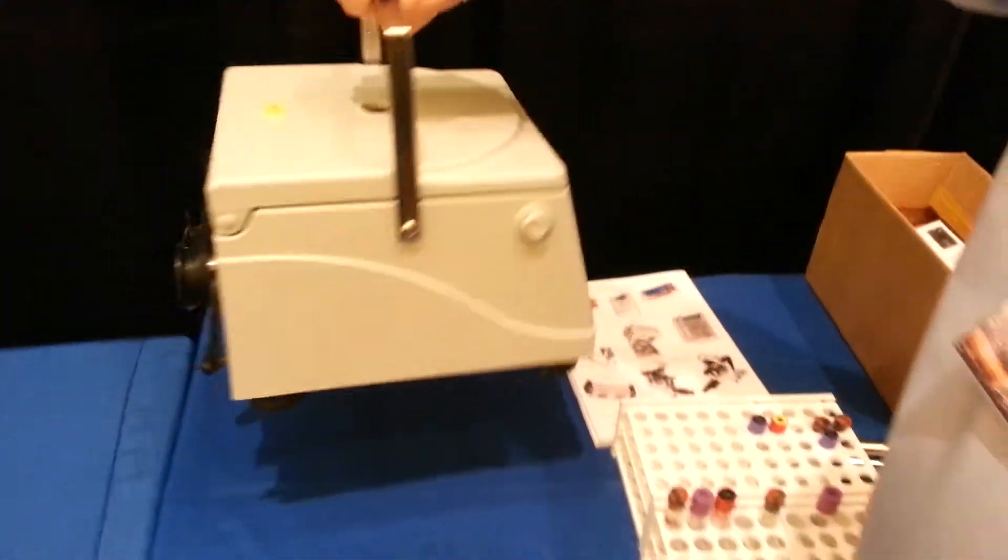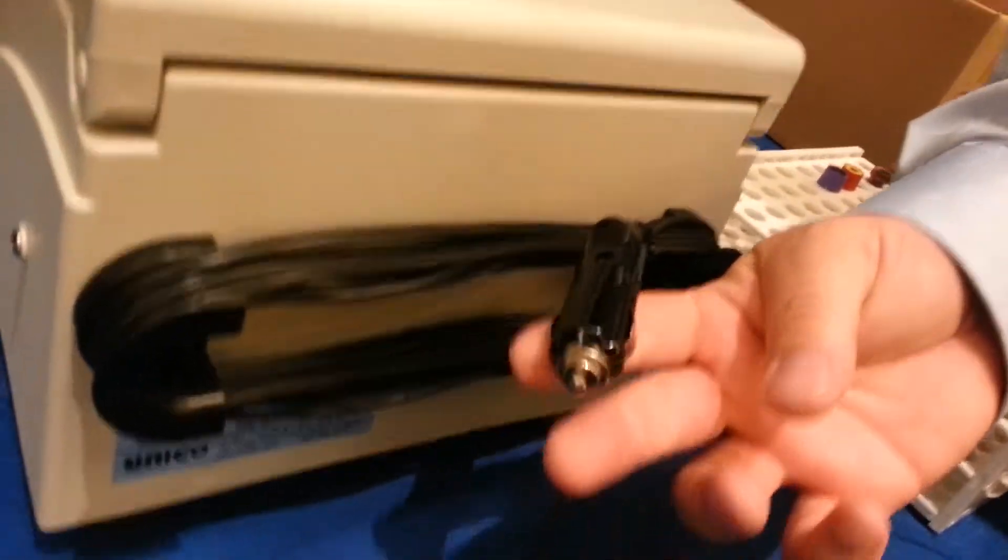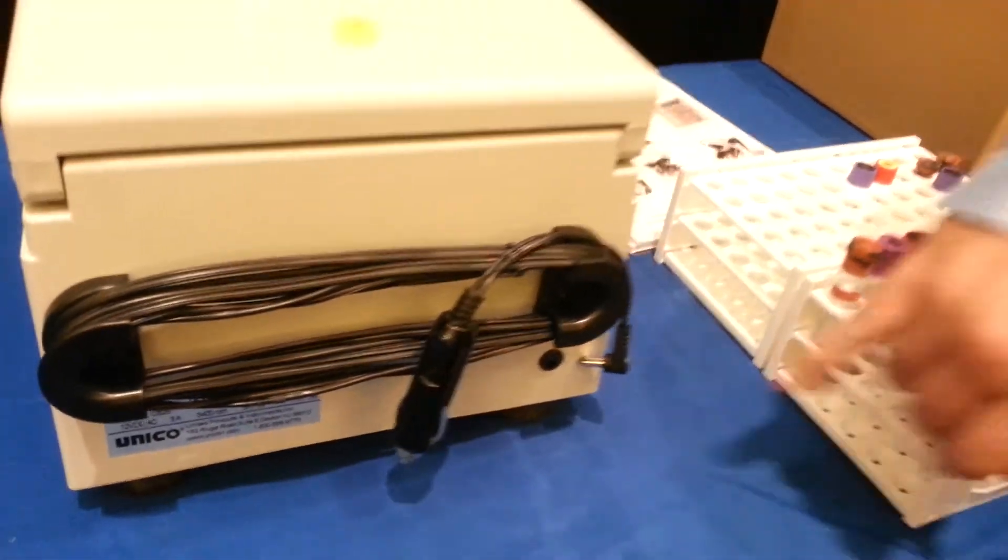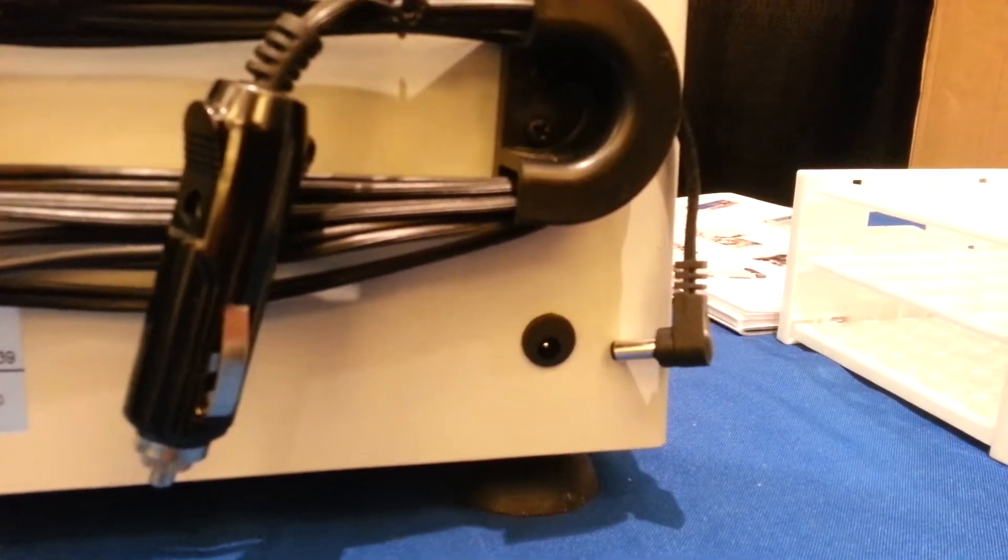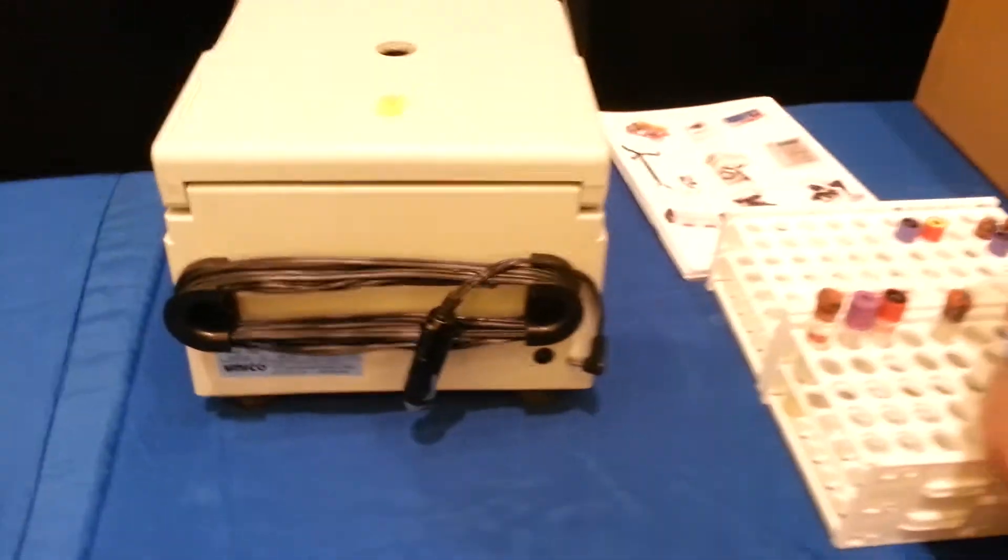We're going to turn it around and look at the back. It's got a nine-foot cord with a 12-volt cigarette lighter adapter. If you look back here, that's where this plugs in. You can also put an optional AC adapter on the unit, so you can plug it into the wall when you take it back to the lab.